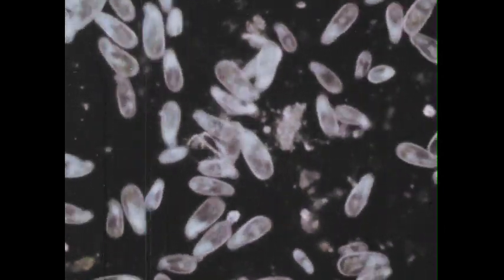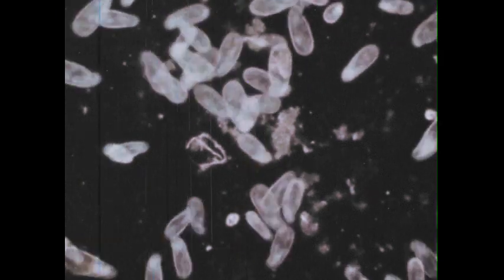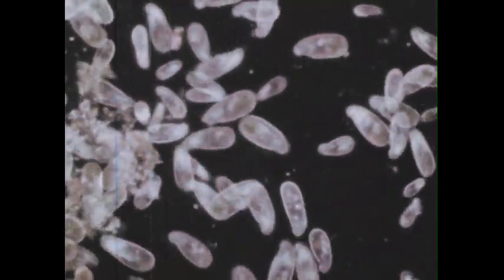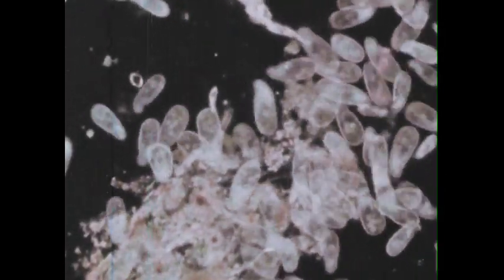Do you recognize these? Of course you do. You're watching Paramecium or one of its close relatives. And what can you tell about it by watching? Are they all the same shape? Are they all the same size? Are they all built in the same way?